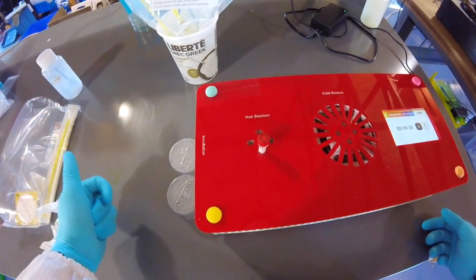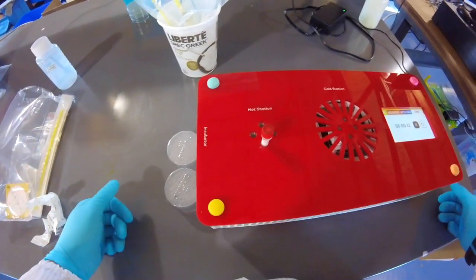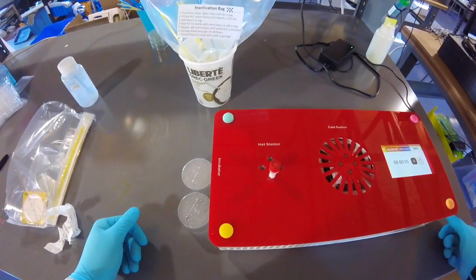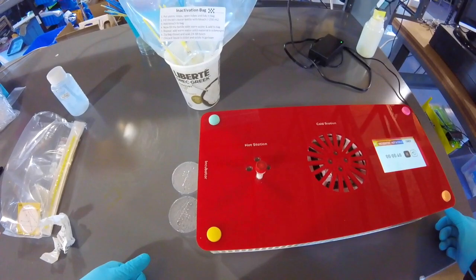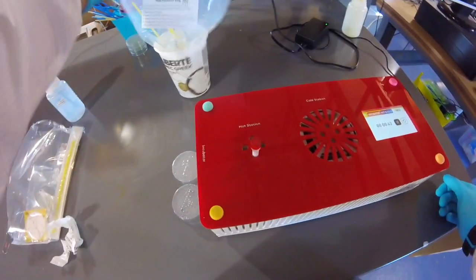So if you put your Petri dishes in there and you have some mold or something flying around in the environment, they could still land in those Petri dishes and grow, and you just don't want any weird growth happening. So if we close the bag, that'll help limit that.